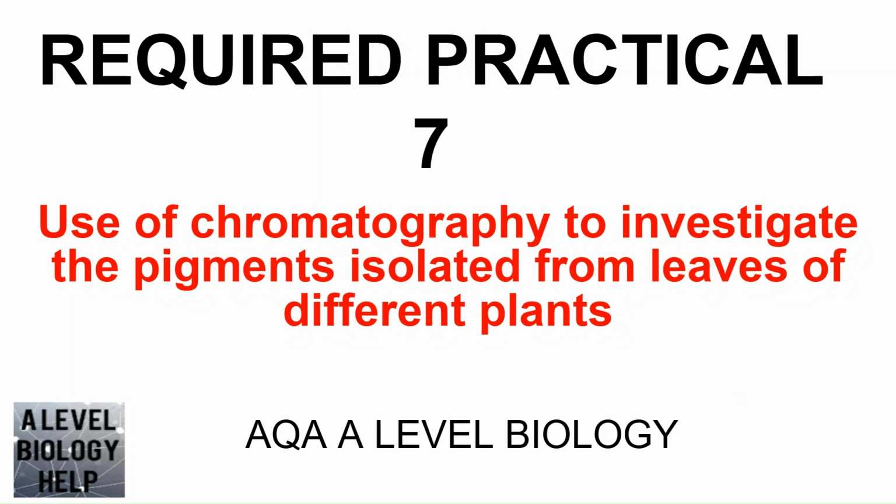So this is another required practical video. This is required practical 7, which is use of chromatography to investigate the pigments isolated from leaves of different plants for AQA A Level Biology.